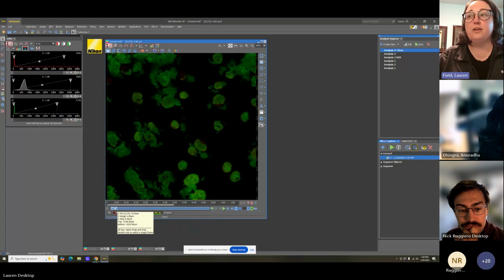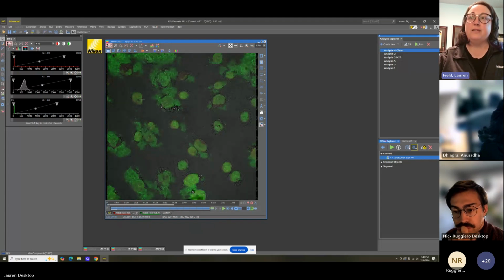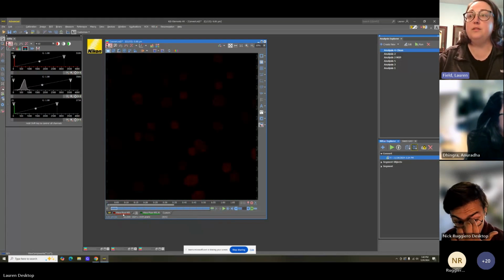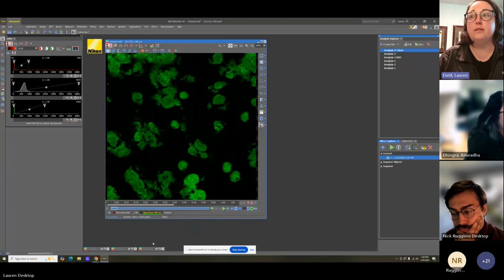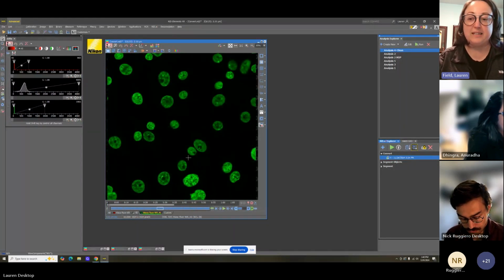And it also doesn't do that great down where we have maybe more muddled DIC images, and it's created these kind of odd structures. This would be one where I would then give it an image, because there's not a lot of red in this channel. So it's probably picking up some random things in here, and we would use this as an input to continue training this algorithm to try and clean up things like this, where it's come up with stuff that it thinks happened, but it was trained on a nice, crisp, clean center picture.